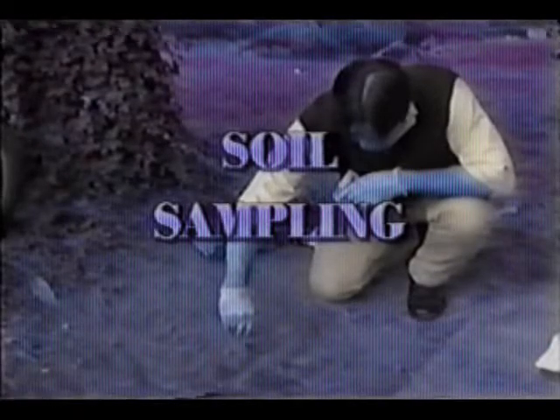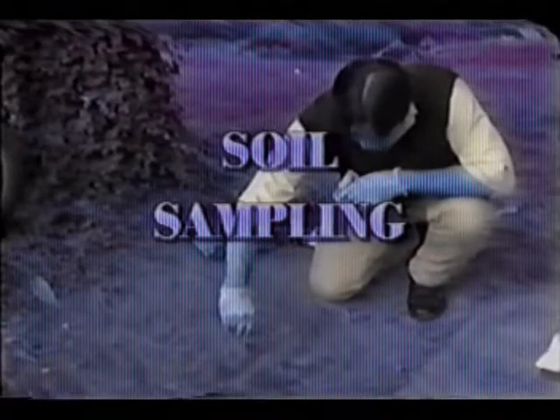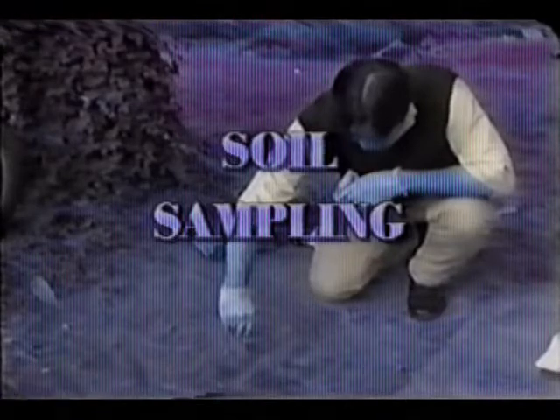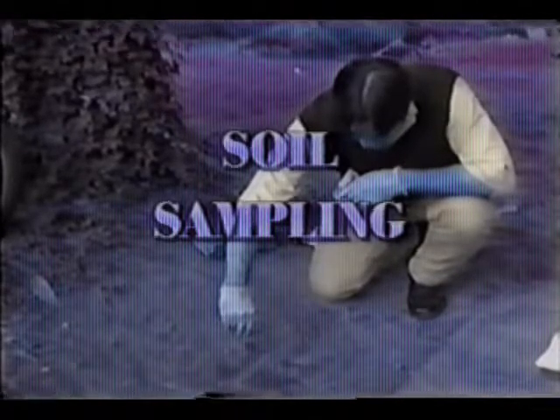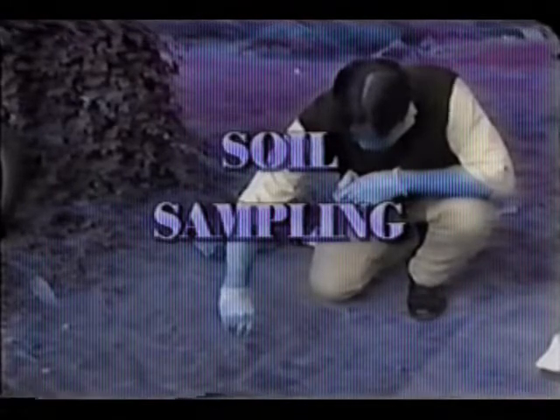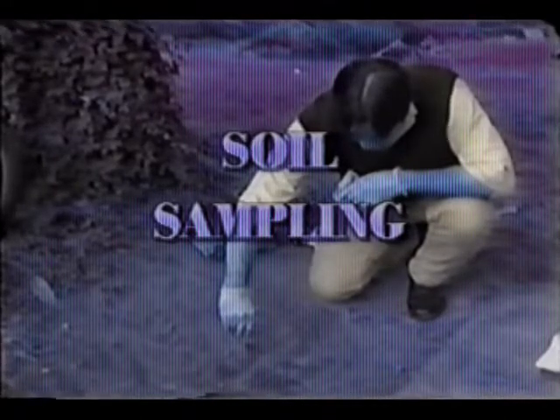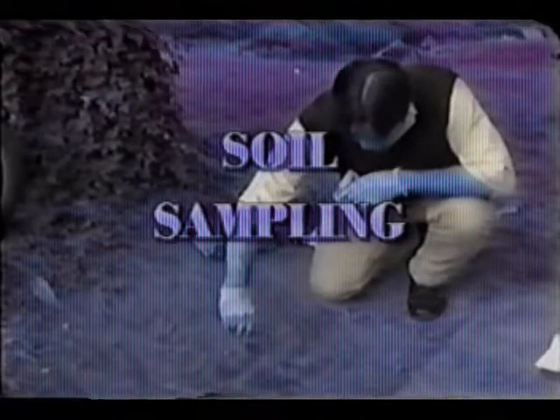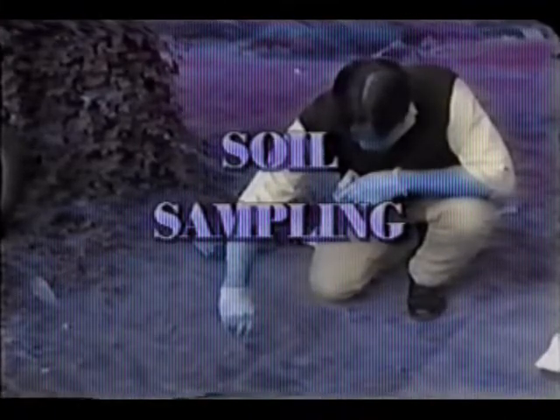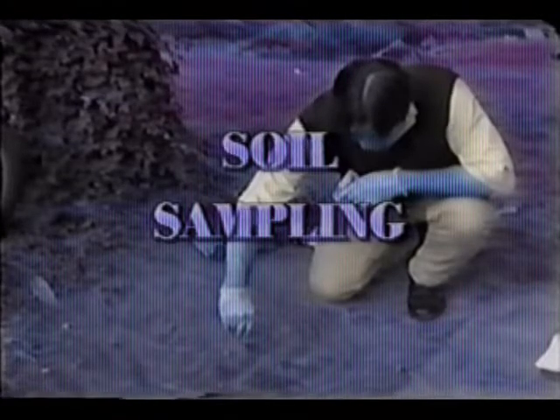Soil samples are typically collected using a method called core sampling. Core sampling is the preferred method because it allows you to collect a consistent sample from site to site. The alternative method of sampling, collection of soil with a scoop, should only be used if the soil is too sandy or friable to collect a core sample. Core sampling will be demonstrated here.